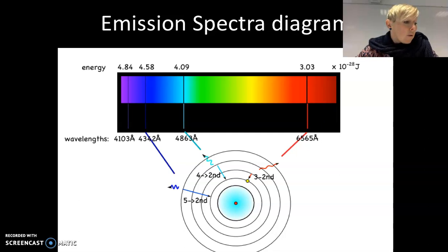And if you look at the discussion questions on page 42, it asks you to consider any patterns that you've noticed. Okay. You've actually got the electromagnetic spectrum drawn for you on page 42. I'd like you to address the analysis questions and the discussion questions. So once you've recorded your observations, consider if you can identify any patterns in the colour emitted from different compounds. And that is the final skill that you'll need to develop this week.